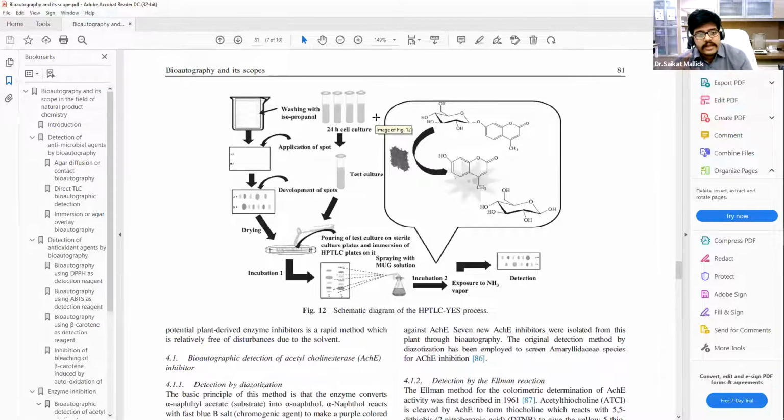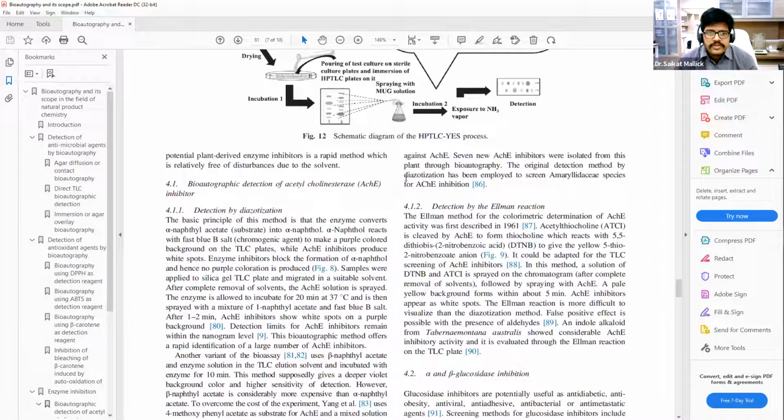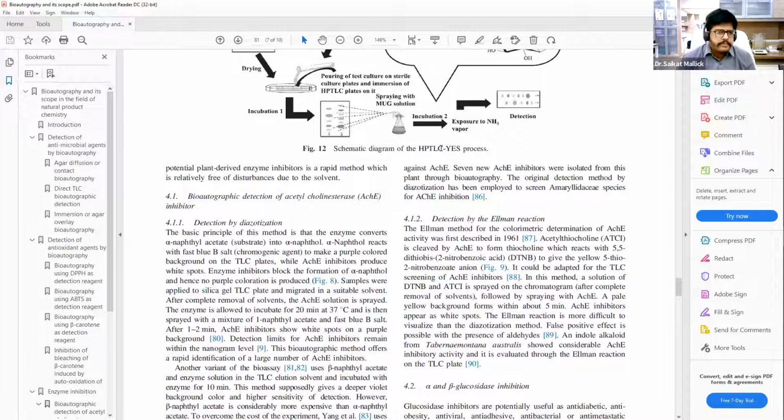So what is happening is, with the help of this extract, they are developing it onto the plate, and directly after they have cultured the cell, they are isolating that enzyme with the help of a reaction, and then they are applying it onto the plate and seeing the result. So this is an example where estrogenic activity is being determined. Now there is another paper which was done by our principals at Camag, which was for estrogenic activity in beer, because of various sources that are used to prepare the beer. But that was just one aspect.